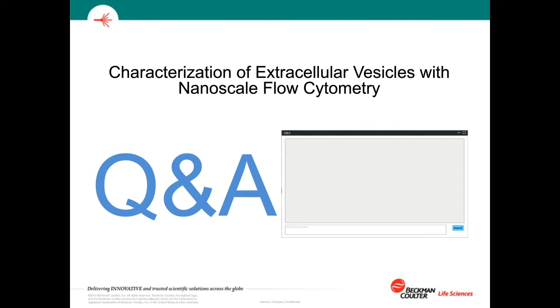And in the case of most flow cytometers, by Snell's law, it actually would marginally shift the refractive index of particles and enhance detection. But for the CytoFLEX, there's a bigger enhancement because the side scatter itself is actually attenuated. So it makes a dramatic difference on the CytoFLEX, but may not make that much of a difference on any other flow cytometer.